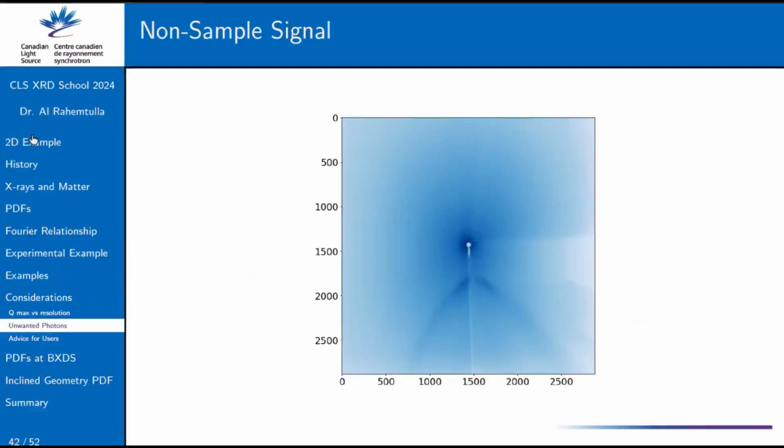So there's a lot of things that, because now we're taking the Fourier transform of everything, we can't ignore, like what we do with powder diffraction, where Joel can go and in GSAS do that nice little background fit with like the Chebyshev or point fit, and you just remove it all because a lot of that stuff is signal. And we have to figure out what part of that is actually signal that we want to put in our Fourier transform and run through the PDF method, and what stuff is junk that doesn't belong there.